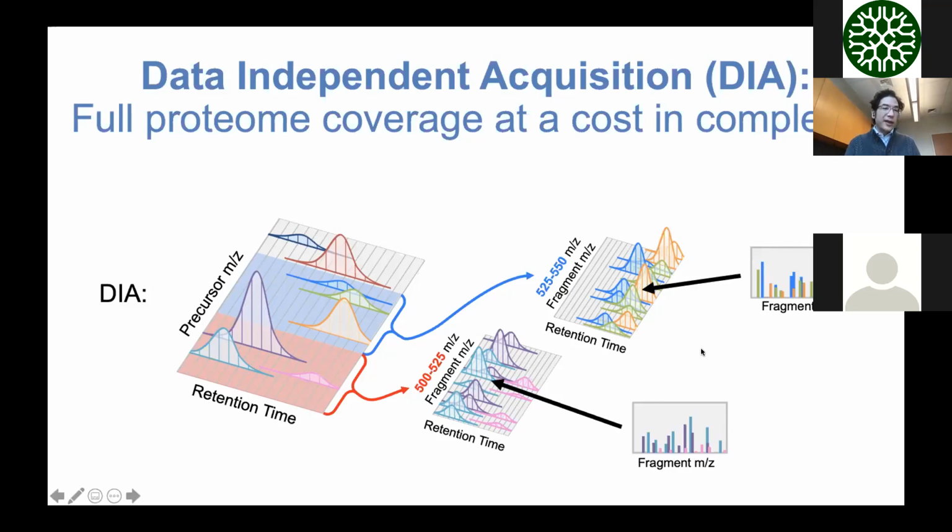This is an extremely complicated style of data to interpret, but at the same time, we're making measurements of the entire proteome as opposed to measurements of very specific peptides. But a lot of the same principles are important here, in particular how we try to make these types of measurements and how we detect peptides from this.